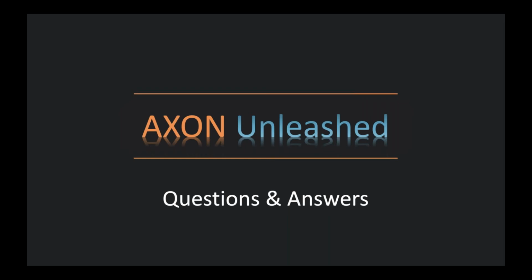Okay, yeah, thanks, Mike. I appreciate it. I was actually hoping to get that comment here at the very end. I know a lot of questions came in during the webinar, and I know you intend to get back to everybody afterwards. But these types of questions, what's next? We make the point of saying this is module-based software, and we talk about synchronicity in particular in that name. So in a nutshell, it's a module-based architecture because we intend to build on this.